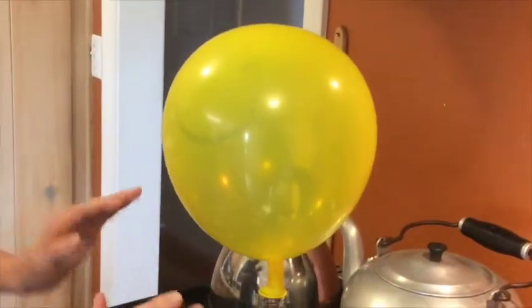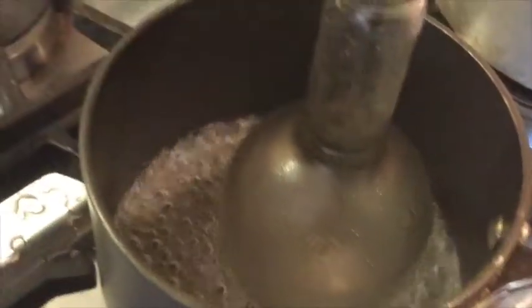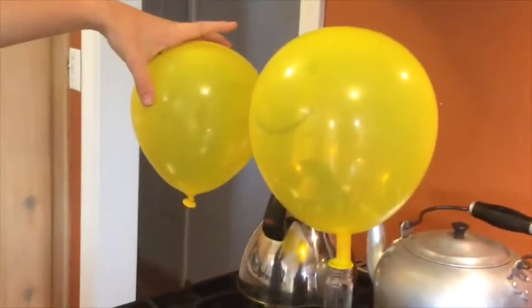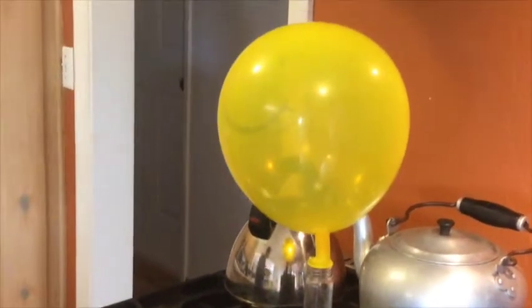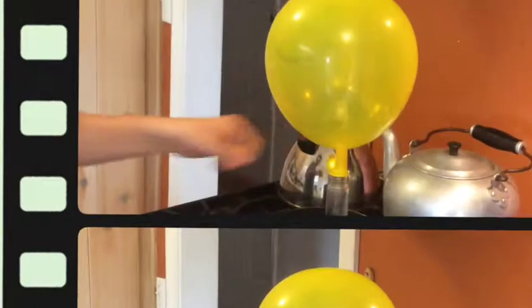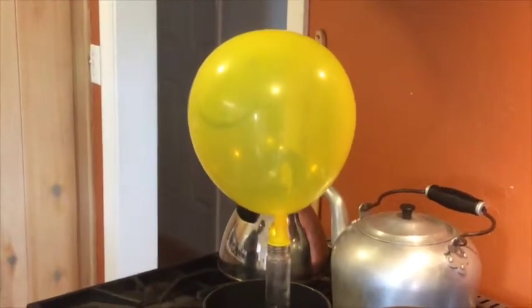You notice the balloon seems to be getting bigger. Don't touch the pot, obviously, tell them to be careful. And see, it's bubbling, it's boiling now. And the balloon is getting bigger. You can compare it to this one. It's much bigger. And that's the control balloon right there on the left. The balloon seems to be getting slightly bigger, about the same size.